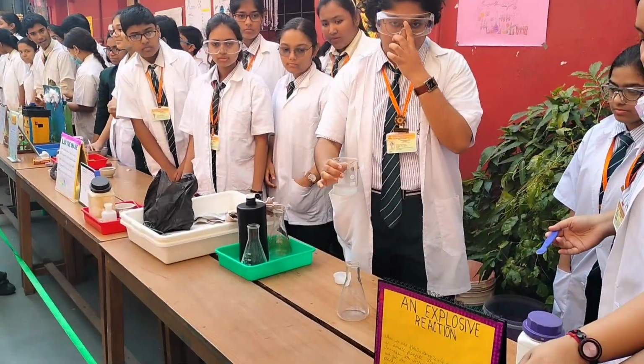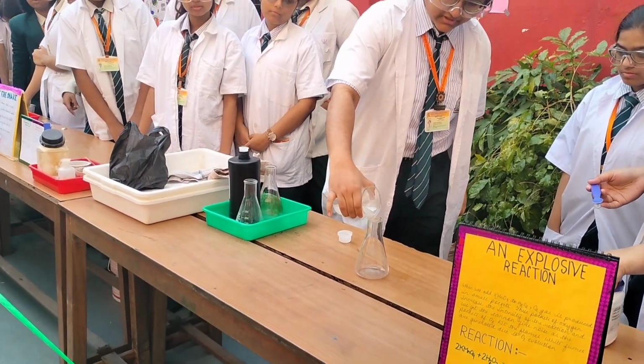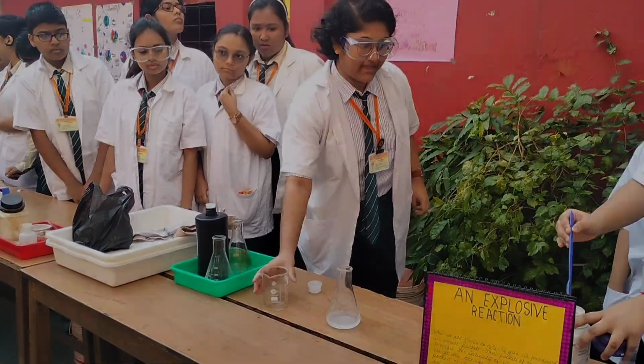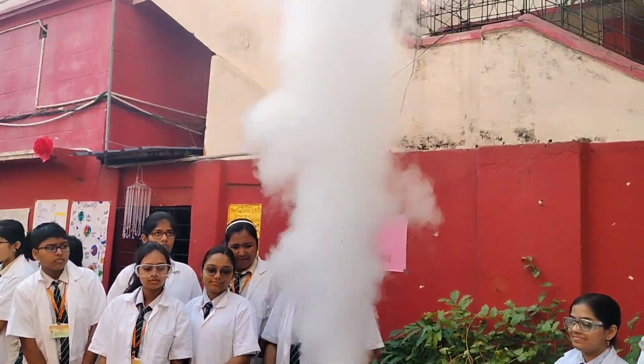This is an explosive reaction between H2O2 and KMnO4. At first we have taken 30% 50 ml H2O2 and KMnO4, and due to their reaction, oxygen evolution took place and the gas came out.